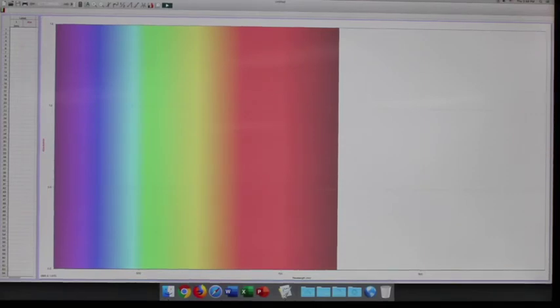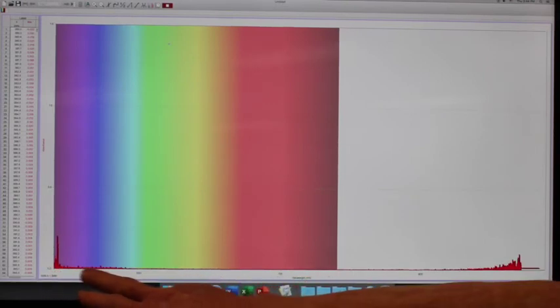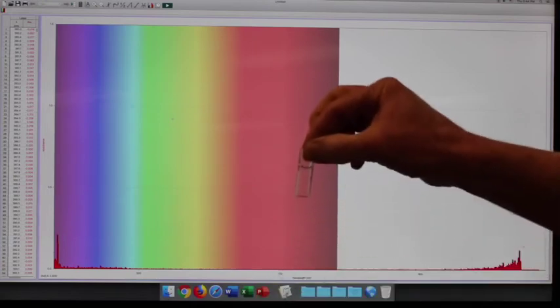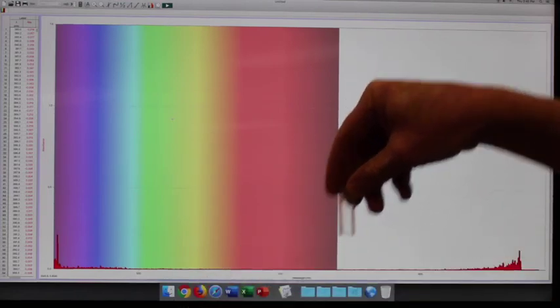All right. Now what is calibration? Calibration is basically taring the scale. So if I hit play up here, what we're doing is setting the amount of light that gets through all of the wavelengths of light in water to 0. So water has its own absorbance qualities, and we're basically taring all of that to 0. Now I'm going to take my blank solution of water out, put it to the side, and now find my experimental DI water.